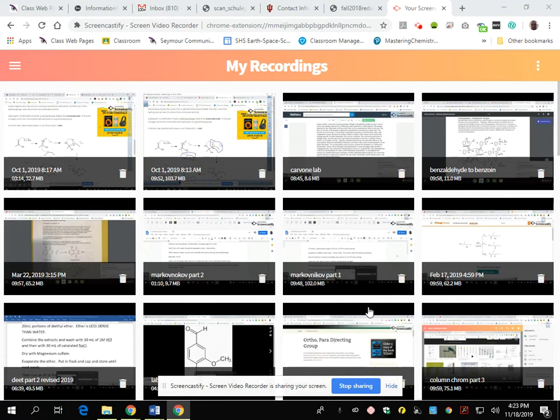Okay, ladies and gentlemen, we're going to do Lab 29 this week. Our scenario this time is that we have some vanillin material. We are Pulp Incorporated, a large paper company, and we make products from the byproducts of paper production.